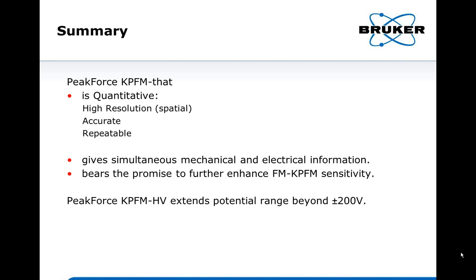There are a number of questions about using this for corrosion earlier on, and here's also a question that says, when you're in aluminum, don't you have aluminum oxide on the surface, but you're still getting the aluminum work function? That's a very good question. For aluminum, it has oxide, and it will definitely alter the work function to some degree.